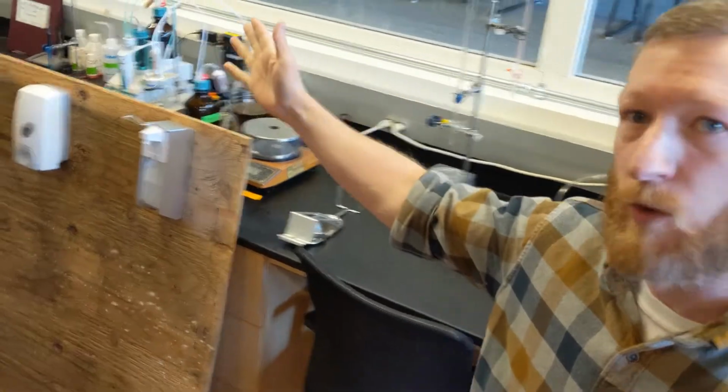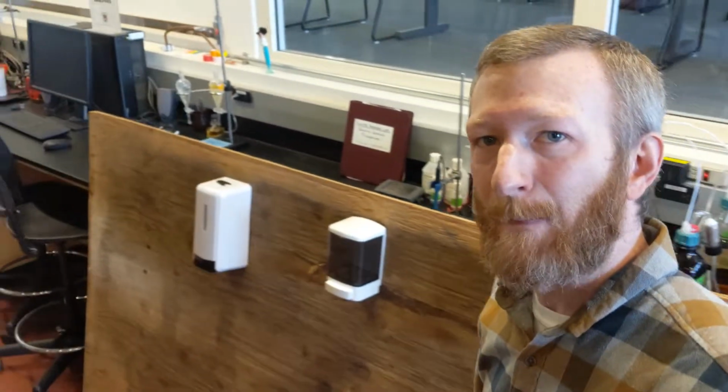There's a lot of testing, though, that has to happen all during this process. And all that testing happens in-house here at Loyola. All of these things are run by undergraduate students, from the production, the equipment maintenance, and the chemical analysis testing. So all along the back wall here, along this back bench, we're going to be doing quality control testing on the biodiesel to ensure that it's going to meet high industry standards, that the reaction happened efficiently, that we removed all of the contaminants, and that it's going to work well in a diesel engine. When we put it into those Loyola shuttle buses, it's going to work really well.